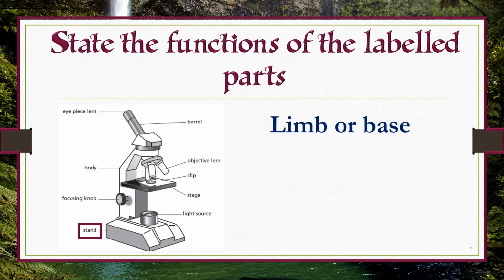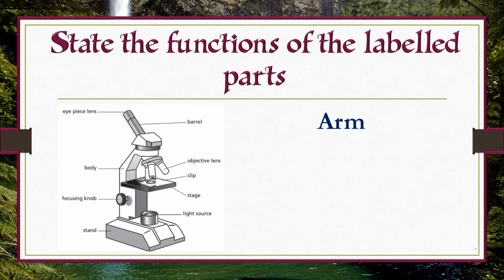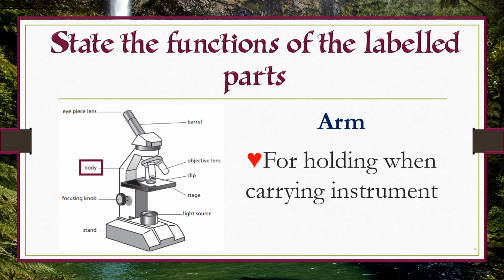The limb or base. This supports the whole instrument. The arm. The arm is for holding when carrying the instrument.